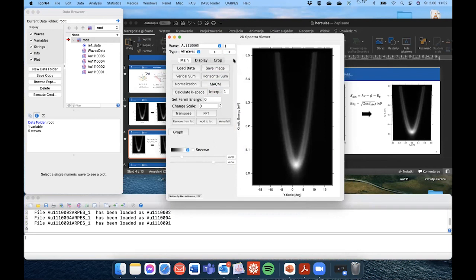So absolutely the first thing that we have to do is to find the real position of the zero. It may look like some kind of trick or some kind of cheating, but in fact it's not, because the zero position that we have on our angle scale is only the zero position that has been set during our measurements, and it isn't the real zero position of our Brillouin zone, because the zero position should be the gamma point, which should be a symmetrical one.